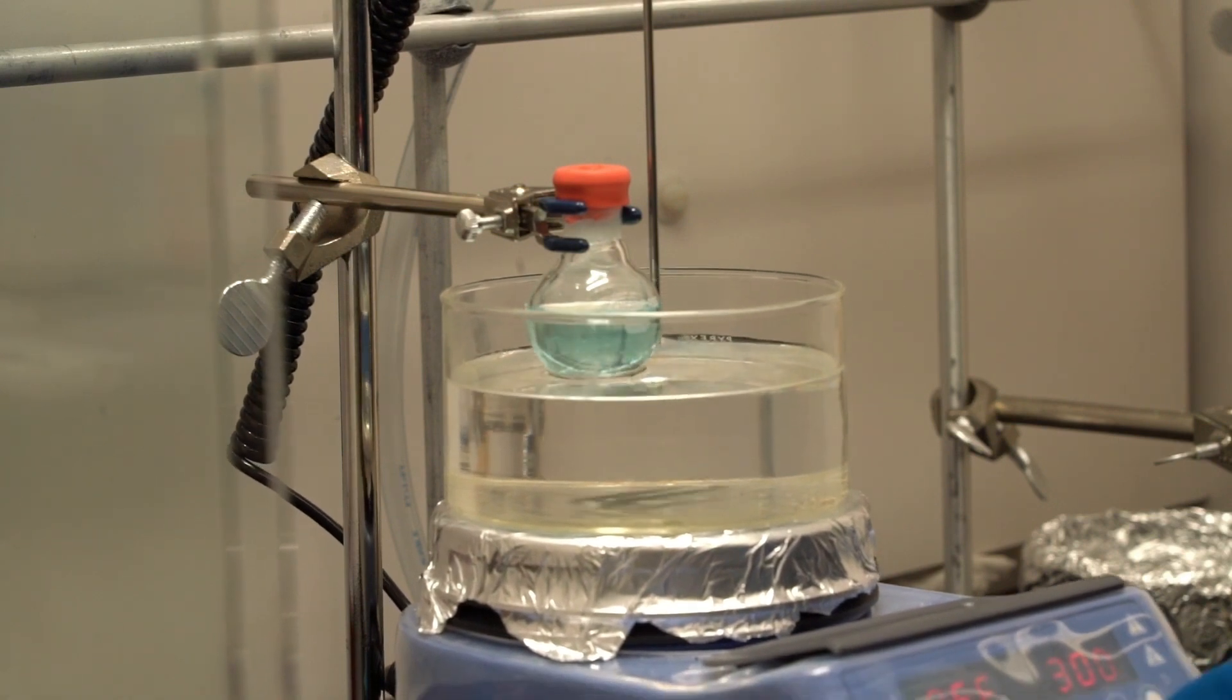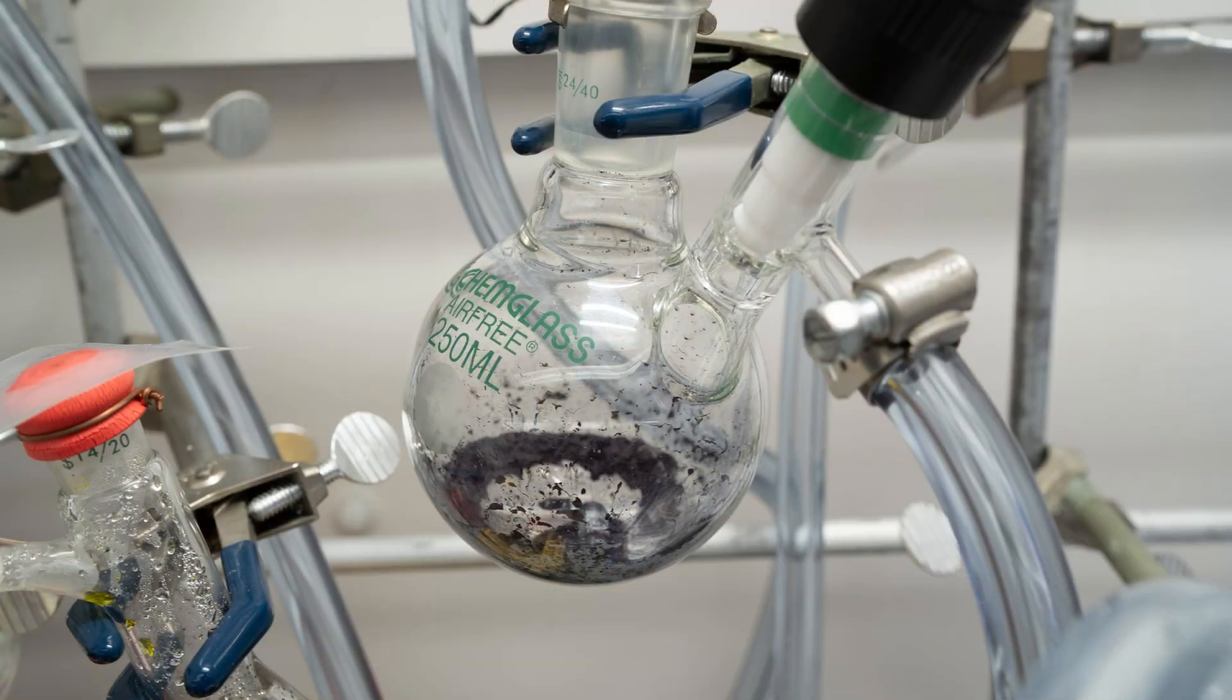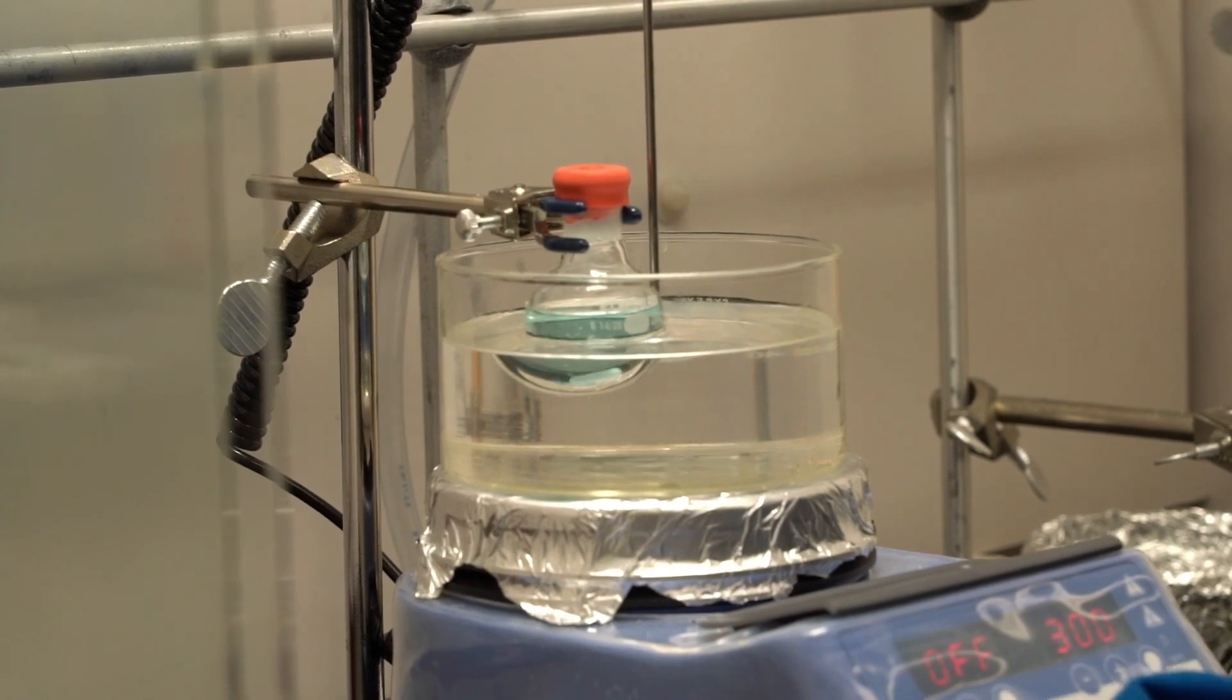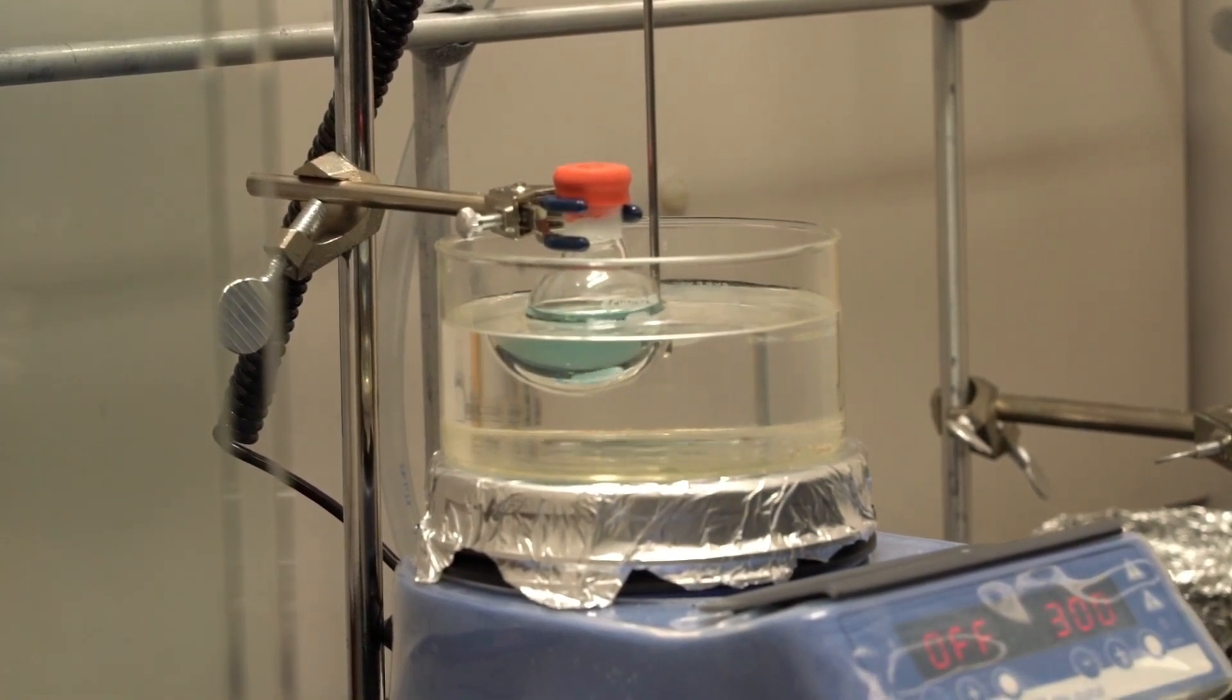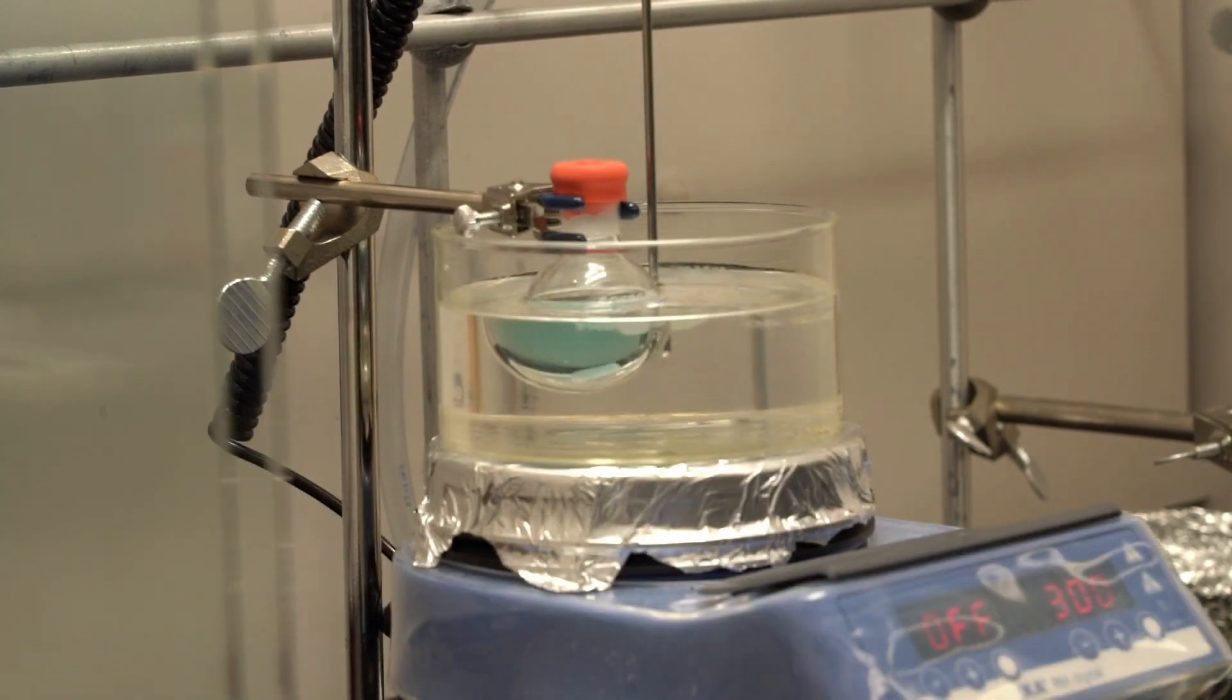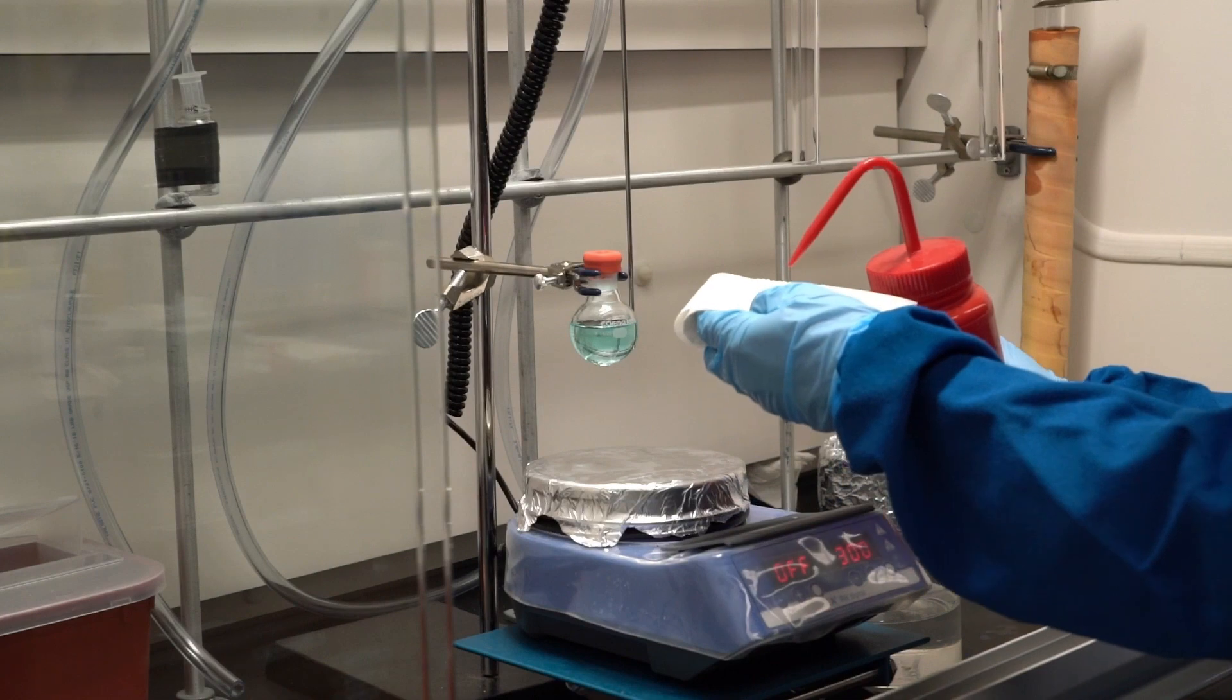When using the oil bath, consider the height of the oil level versus the reaction liquid. If you are forming crust on your flask walls, you can place the oil level a little bit lower than the solvent level. If you need better temperature homogeneity in the reaction, the solvent level should be a bit lower than the oil level.